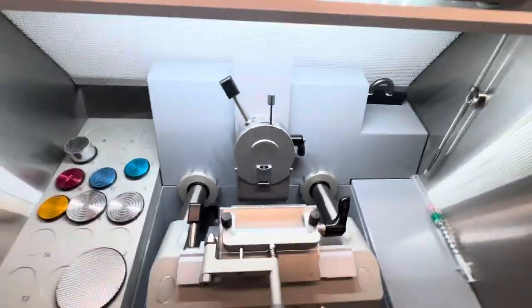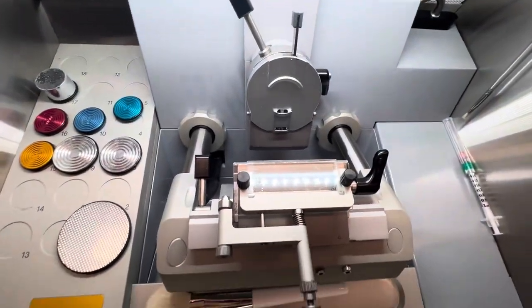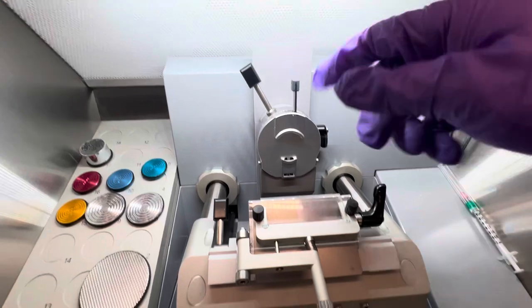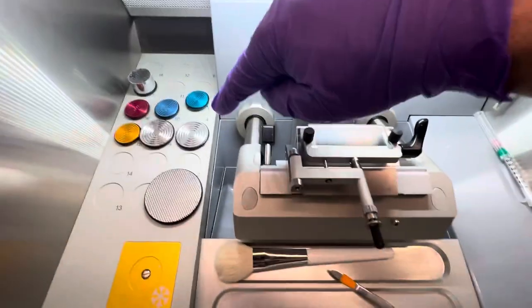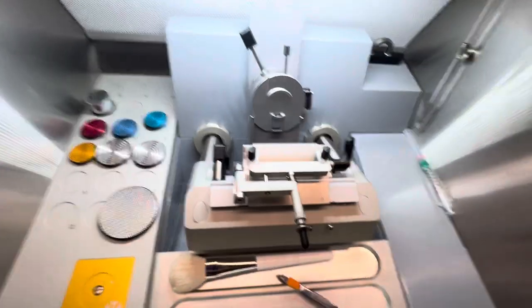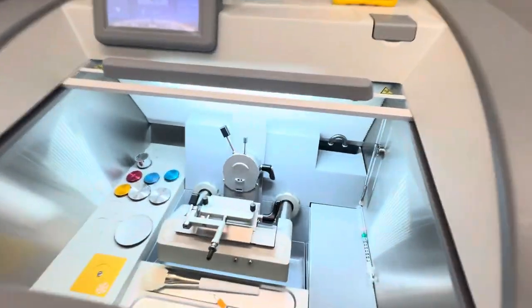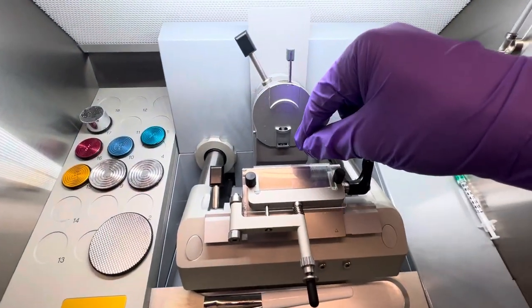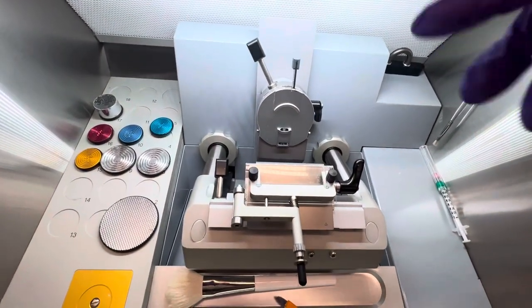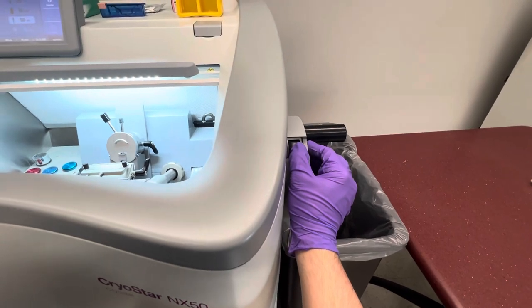In terms of actually cutting, you'd want to move it up to just before the block. There'd be a fine hair of space, but if you go too far, you'll take a chunk out, and if this stage hits it at the wrong angle, it could knock it off the chuck and it just goes flying. It's wild if you see it, but I hope you don't. Once you get it up to the actual face of the block, and I don't have a block out right now to give you an example, then you could start taking sections.